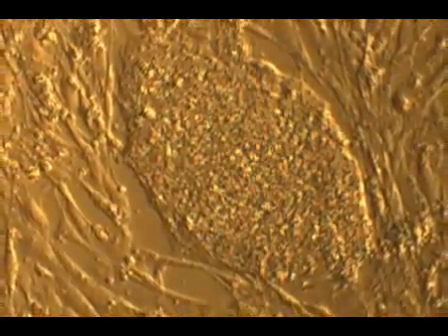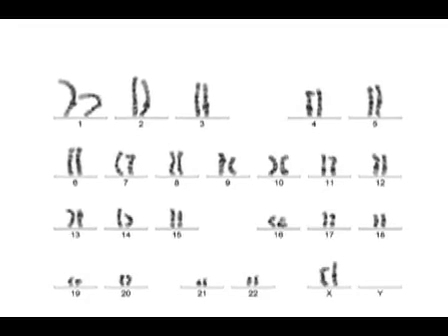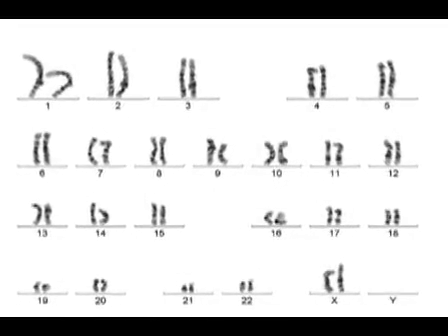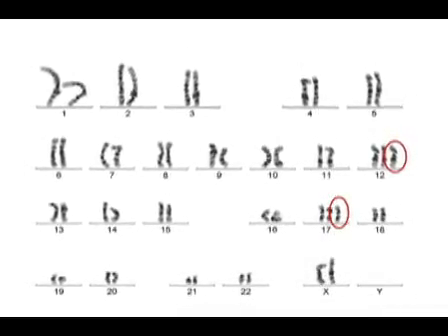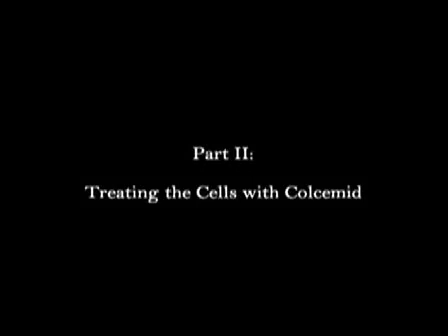The characterization of the genetic integrity of HESC in vitro is crucial, considering HESC as an essential tool in embryogenesis studies and drug testing. Furthermore, for future therapeutic purposes, chromosomal changes are a real concern as they are frequently associated with carcinogenesis. So, let's get started.